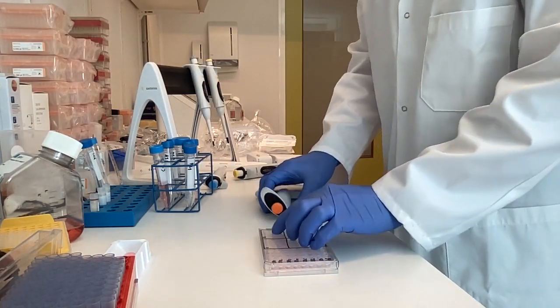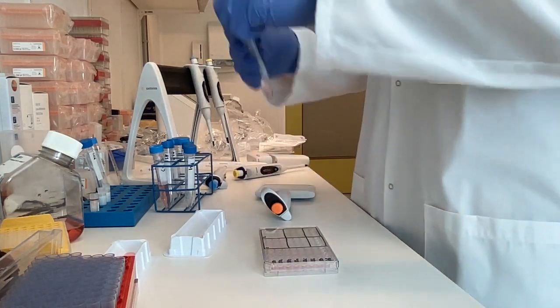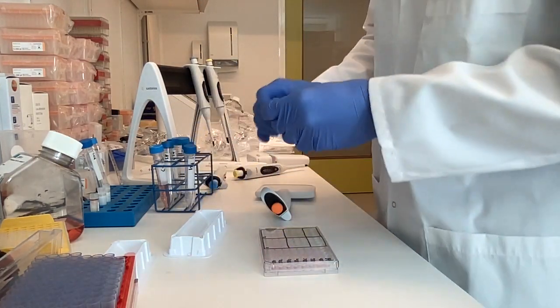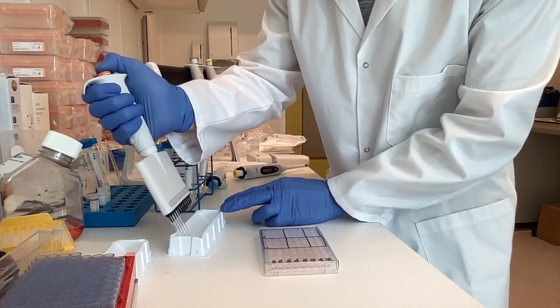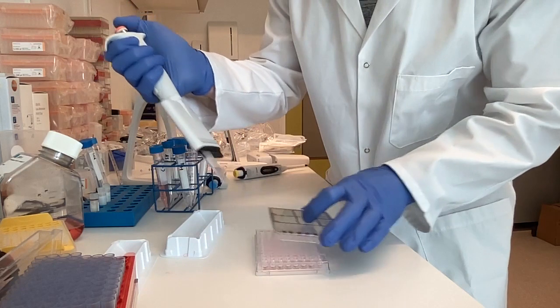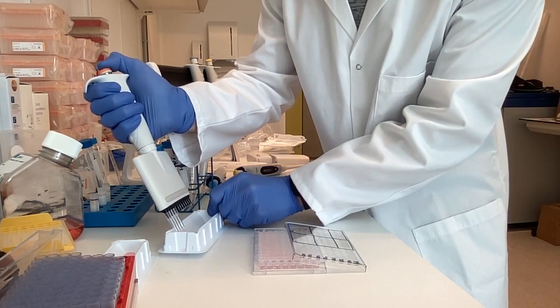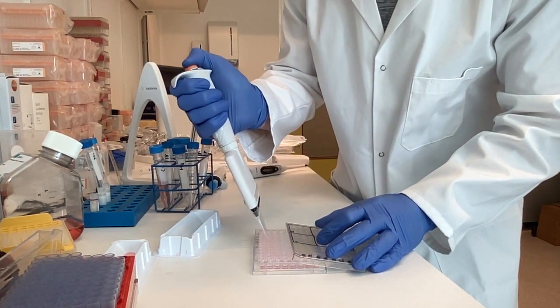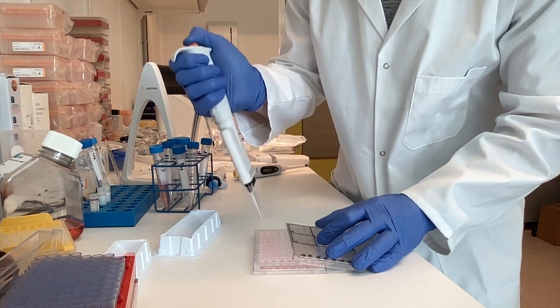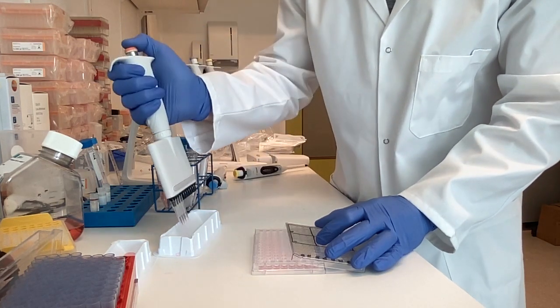You can do the following for sample number 2, and I will just show you how you can do it with the container. It's just a little quicker, I guess. So you take product number 2, and of course it's a low volume, so take 100 again, add it in A, where product 2 needs to go, again take 100. In B, mix carefully. Take out 100. Go to C, the 3rd dilution of product 2, mix 10-15 times, take 100 out, and get rid of it.